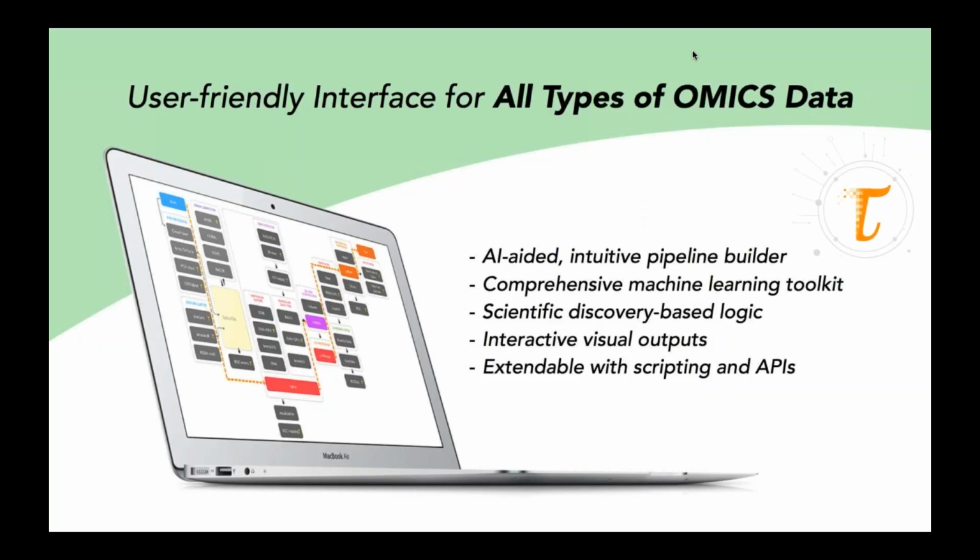interactive outputs. And just a side note, the platform is extendable. It is fairly easy to add new scripts and new functionality to the platform. And as we get requests for specific features, we are working to update the platform and make it more useful to the people that want to get insights from these big data sets.